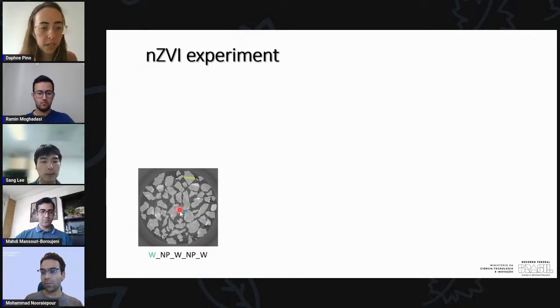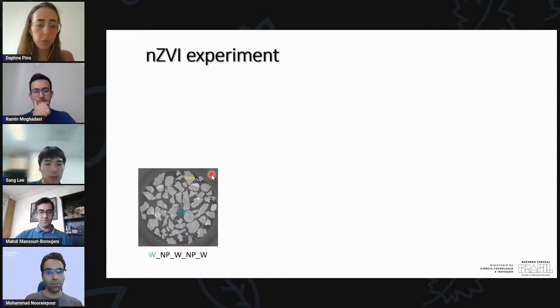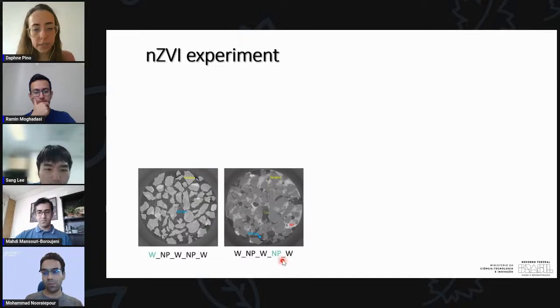So we see water here in the darker gray and our grains in the light gray. This was after the first water injection, so that's all we have. This example is after the second nanoparticle injection. So you see here, there's water, nanoparticle, and water again, our 5 injection phases. So we have, again, the grains. We can still see the water, but now we see the nanoparticles here in a brighter gray. And we also see that some gas bubbles were formed here.